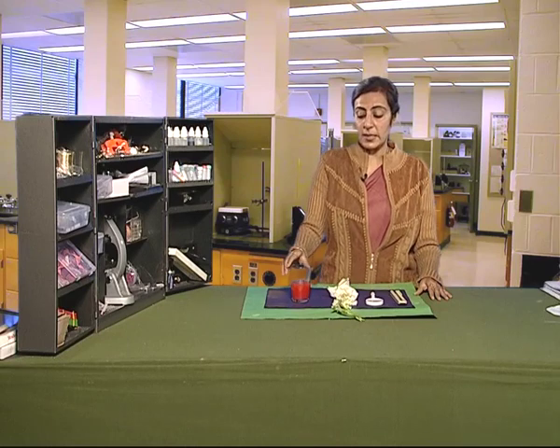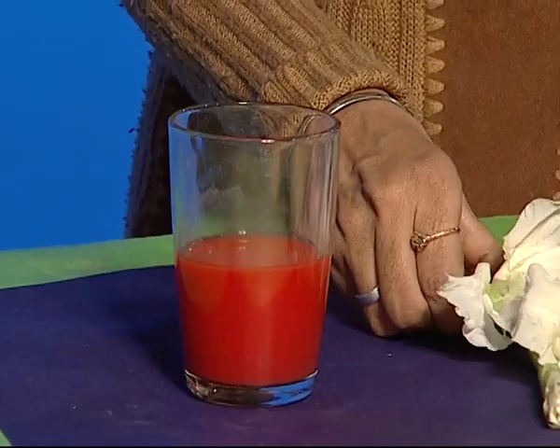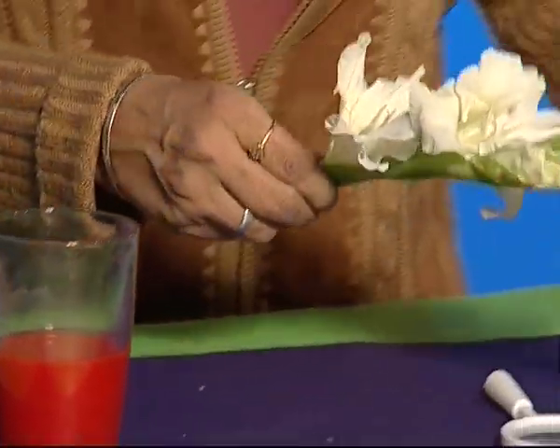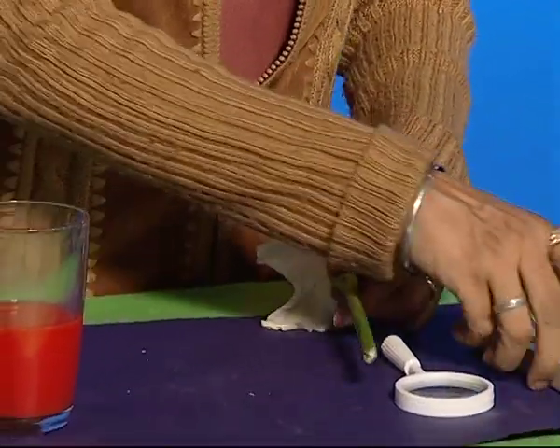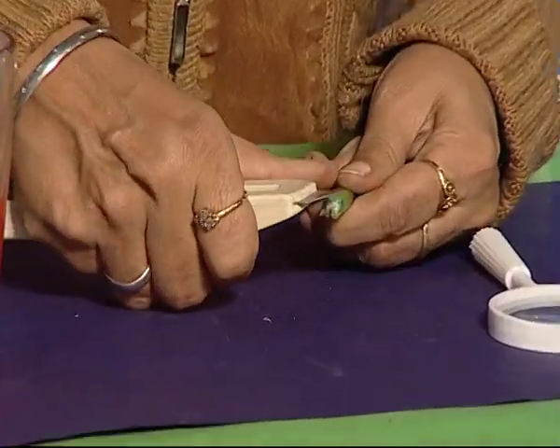First, we take some coloured water in a tumbler, and then we take the twig and give an oblique cut at the end of the stem.